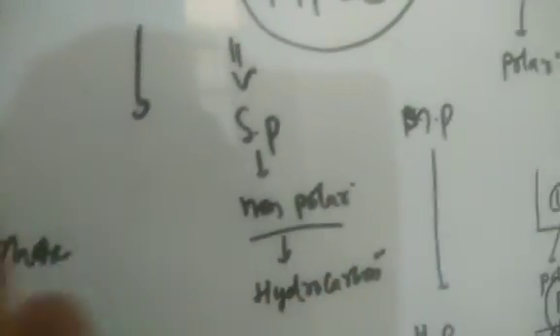So in general HPLC we basically use this reverse phase method, where we modify the stationary phase with hydrocarbon, and then we have fine particle size, and the pressure of the solvent is high. So it's a fast process, and we can do many things in less time and in an effective way.